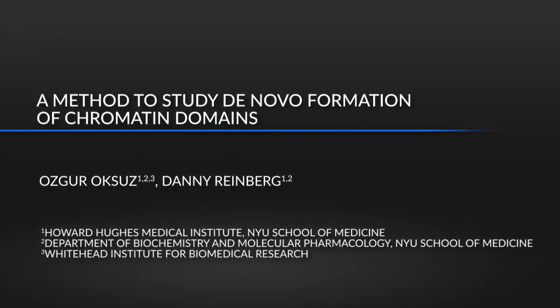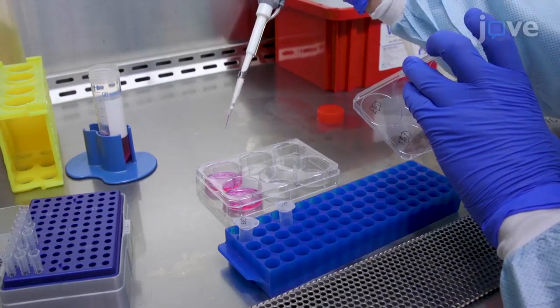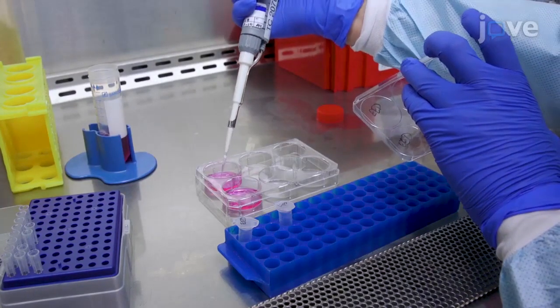We outline a system to assess the dynamic formation of chromatin domains. We utilize the system to follow the recruitment and spreading of PRC2-mediated chromatin domains in cells. The process can be paused at any time to analyze the events in progress.